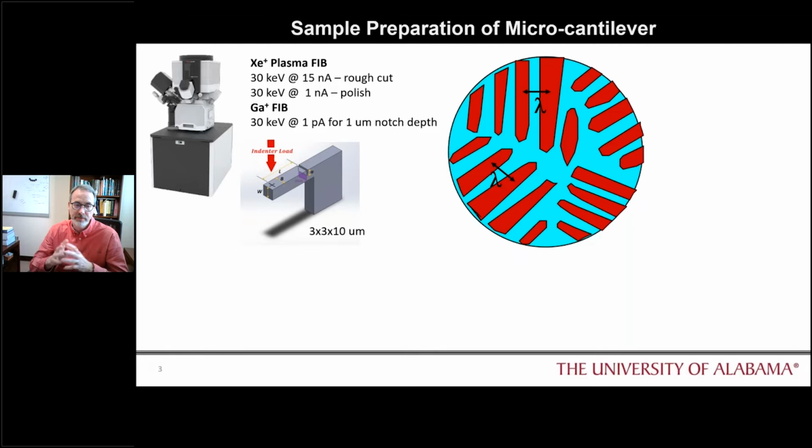Using that, this is a video that shows the behavior. Let's see if this actuates, and I'll bring out a couple of comments on experimental realities. One thing you can notice is clear icing that occurs. Of course, I'm in Alabama, with the humidity. When you cool things, you get some water condensation that's going to form ice. This can actually get removed if you allow the system to pump for a sufficient amount of time.